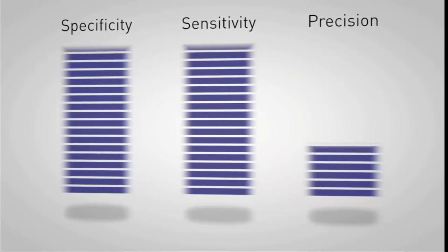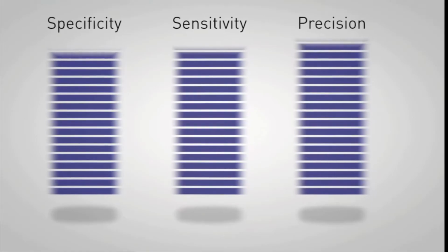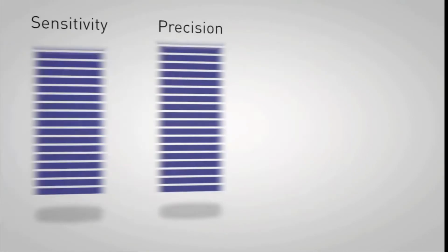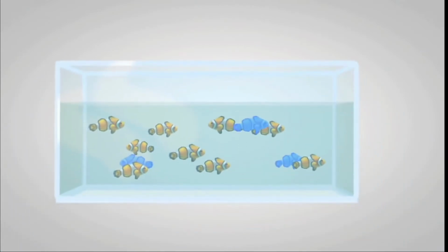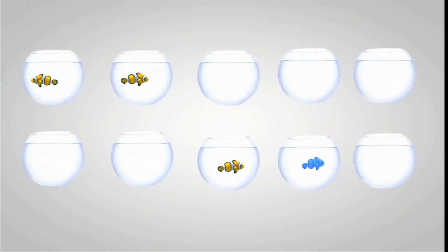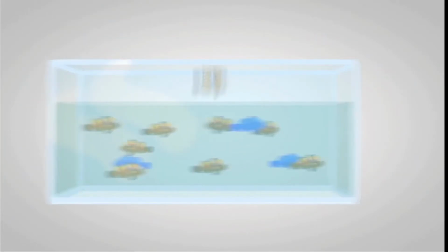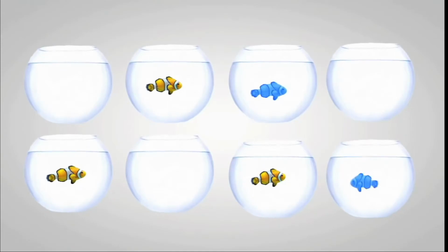Within absolute quantification are performance attributes that enable applications to go beyond the limits of real-time PCR. Digital PCR enables increased sensitivity and specificity of target detection as the partitioning of samples into individual reactions reduces competition of background DNA. Volume sampled also affects sensitivity. For example, if an inadequate volume is sampled, there isn't enough sensitivity to detect a rare target. Increasing the volume sampled naturally increases sensitivity.